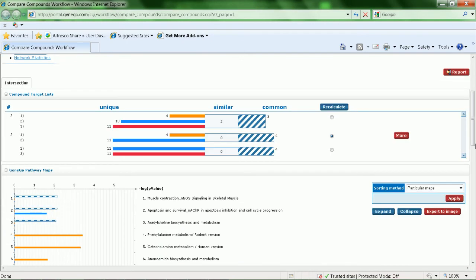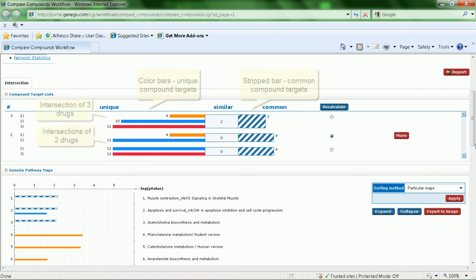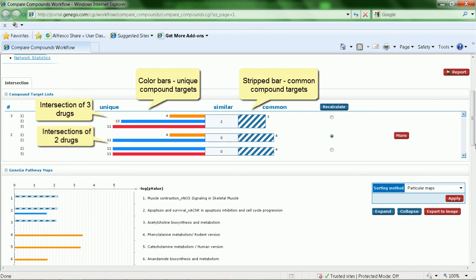In the first step, Metadrug determines the intersection of the targets found for the three compounds through the similarity search to identify unique and common targets.